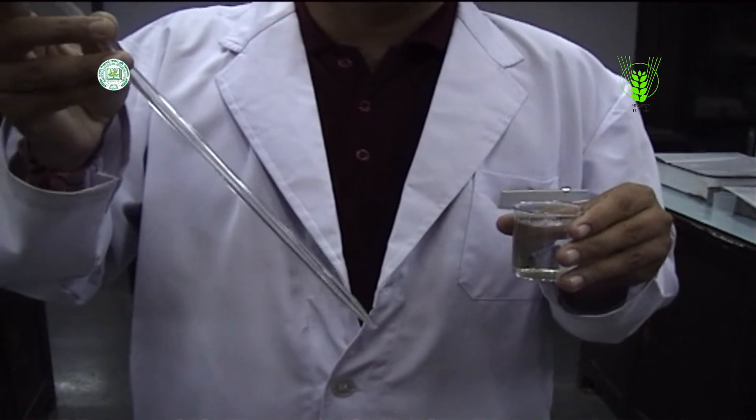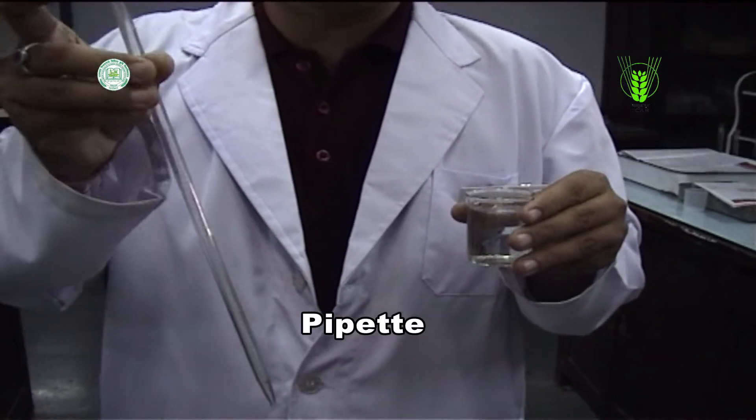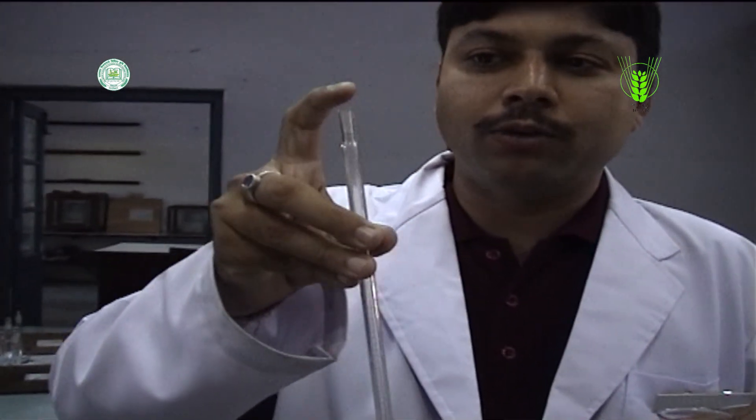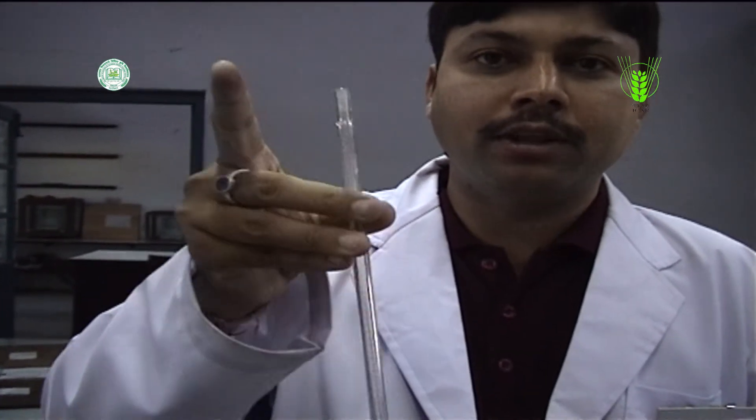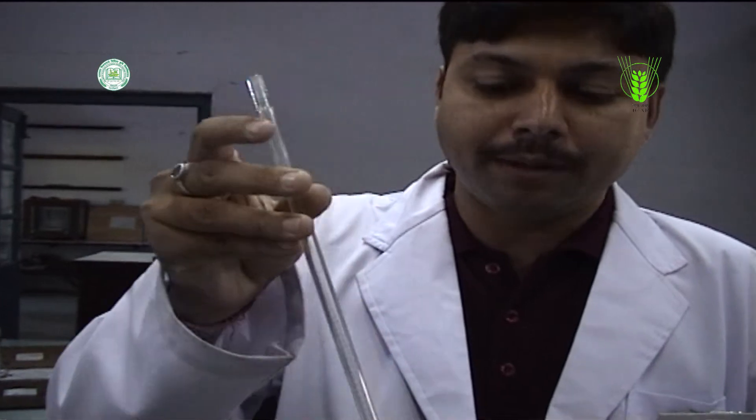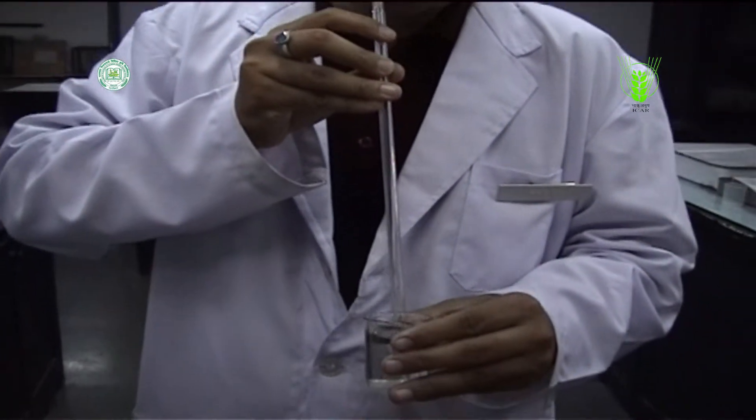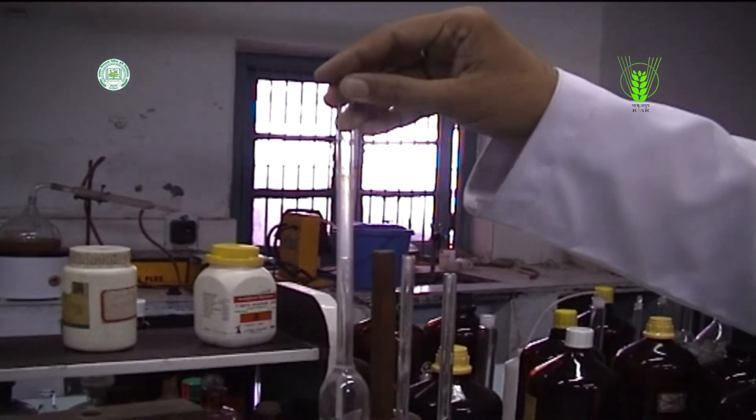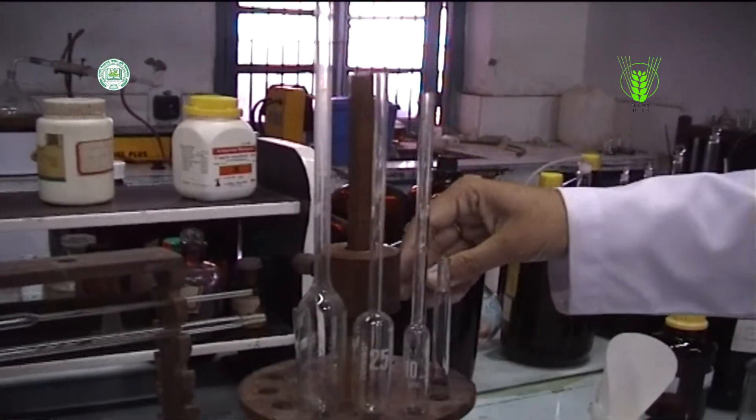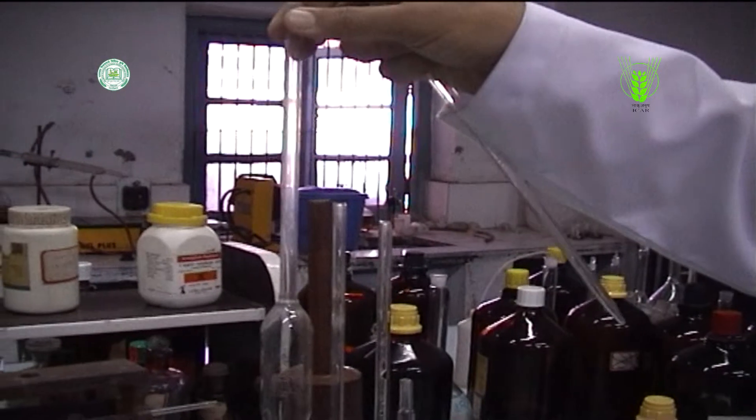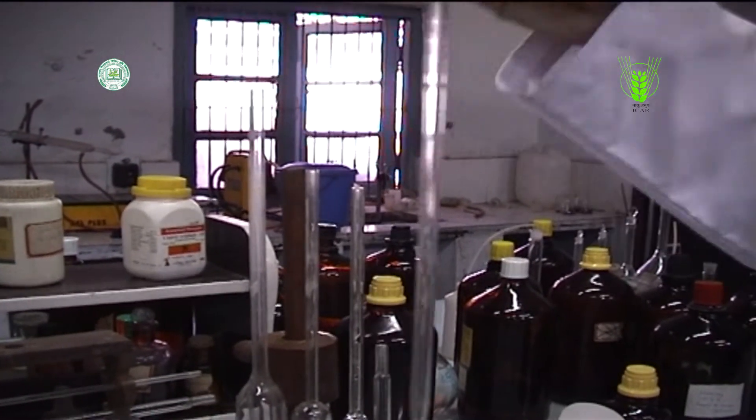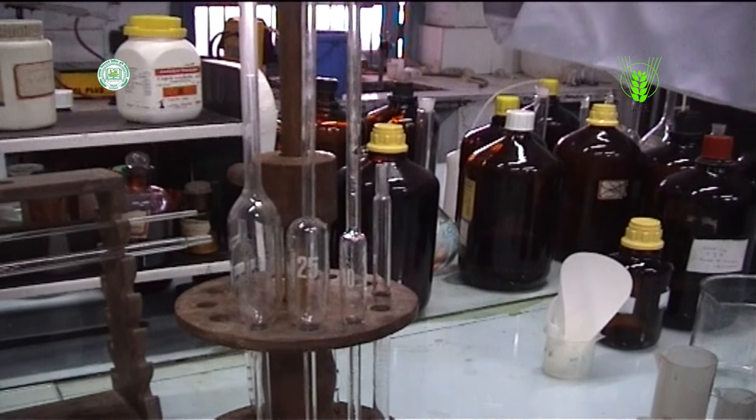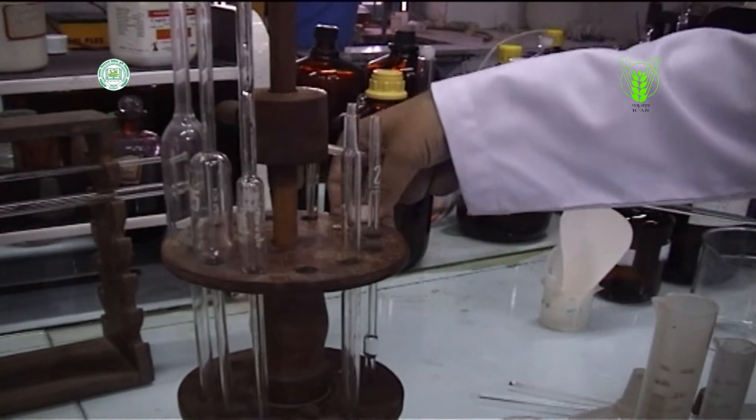Pipette. Pipettes come in several designs for various purposes with different levels of accuracy and precision. From single piece of glass, pipette bulb pipettes, graduated pipettes, to more complex, adjustable or electronic pipettes.